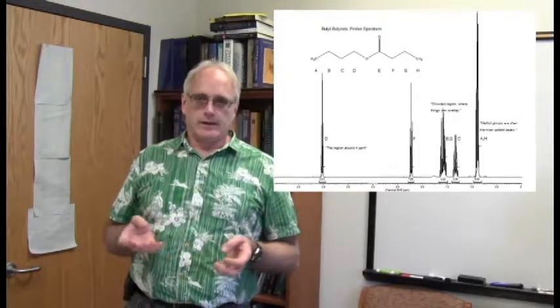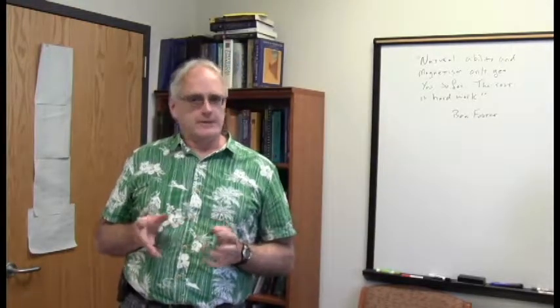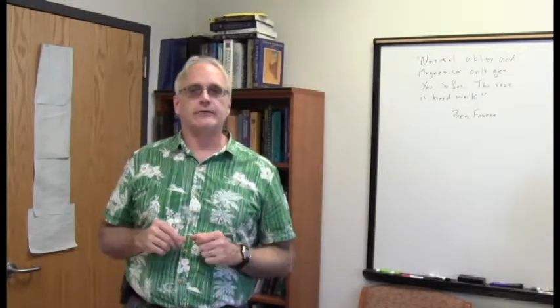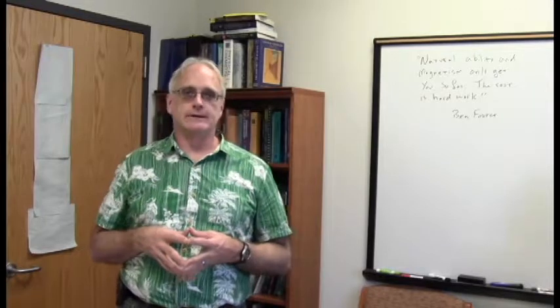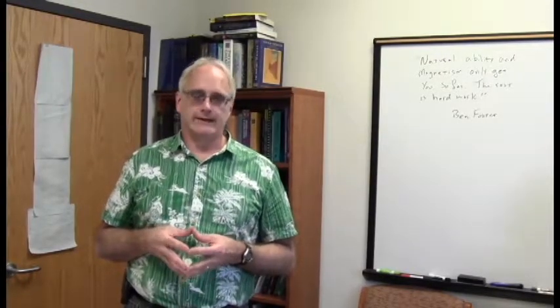I have had more than one chemist in my career tell me, ppm, really? I did not know NMR was that sensitive, could measure concentrations that low. And I just smile and sigh and go on to explain that no, it is not parts per million concentration, it's parts per million in the resonant magnetic field.